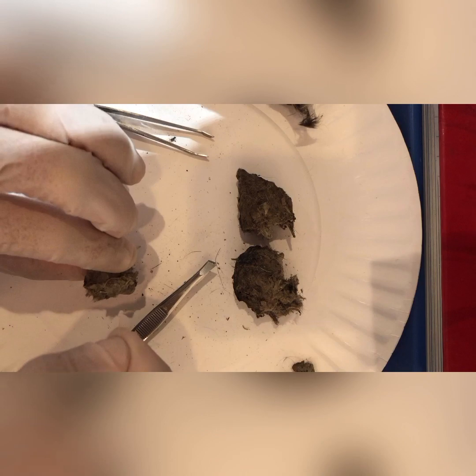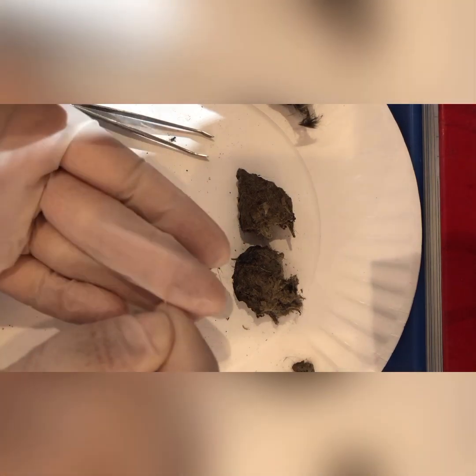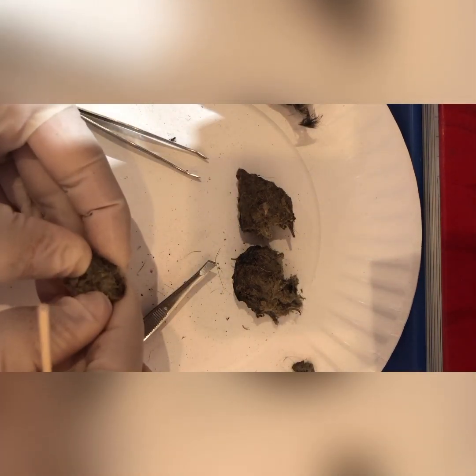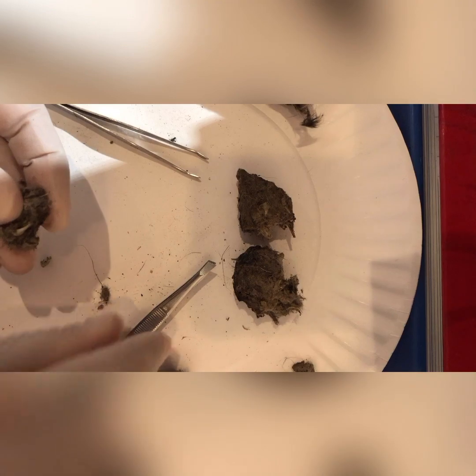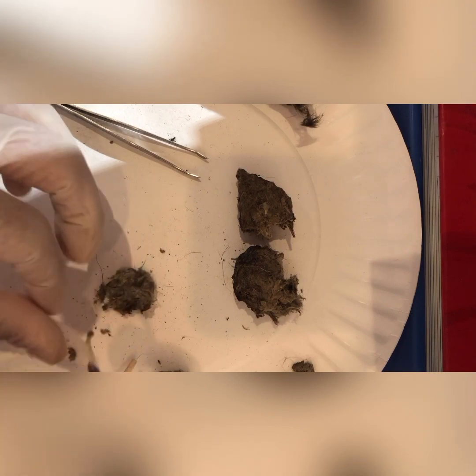You'll see some little bones, and these little bones here, I don't know if you guys can see, this is an actual rib of some kind of animal. I'm going to put that off to the side. We're going to keep opening, keep dissecting, and a whole bunch of little bones. These little bones are already giving me some hints that this was not a bird.